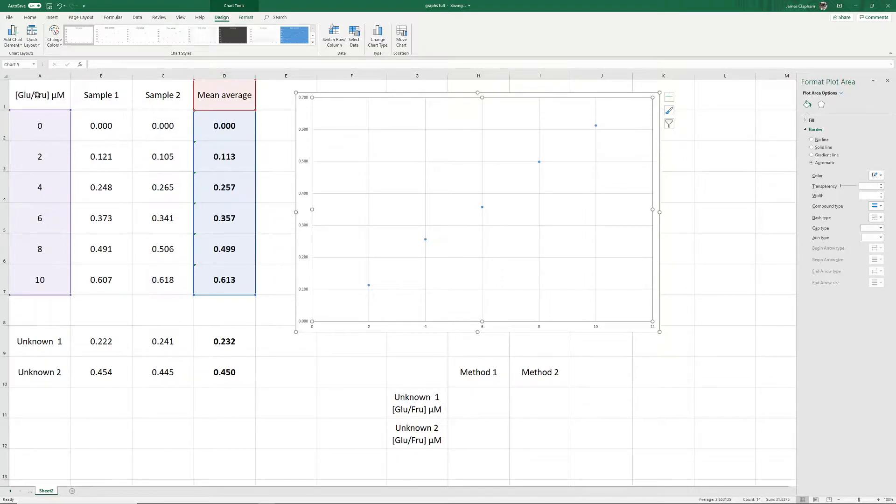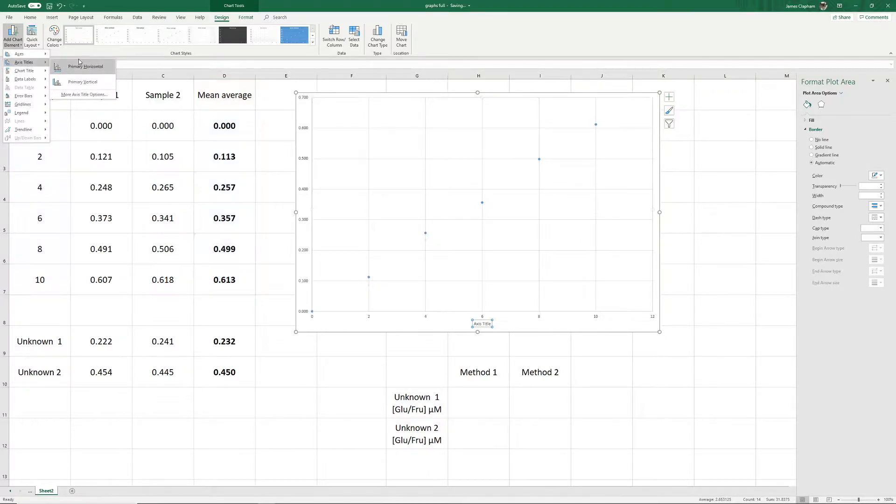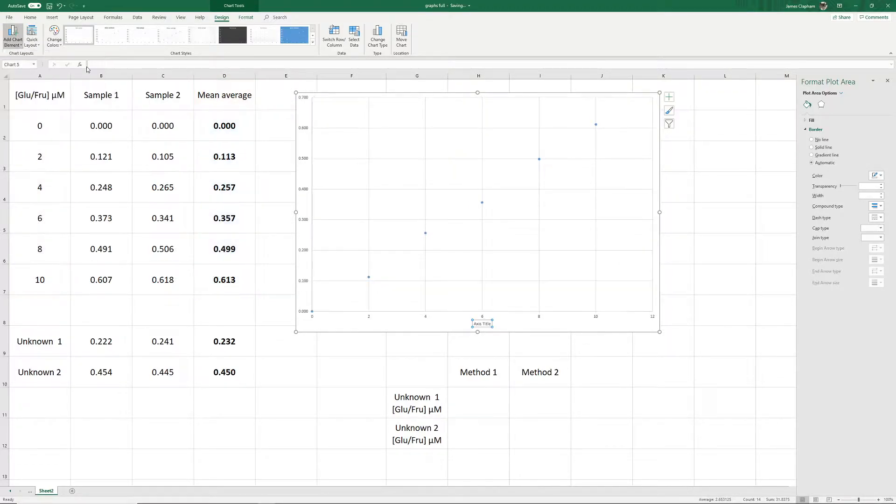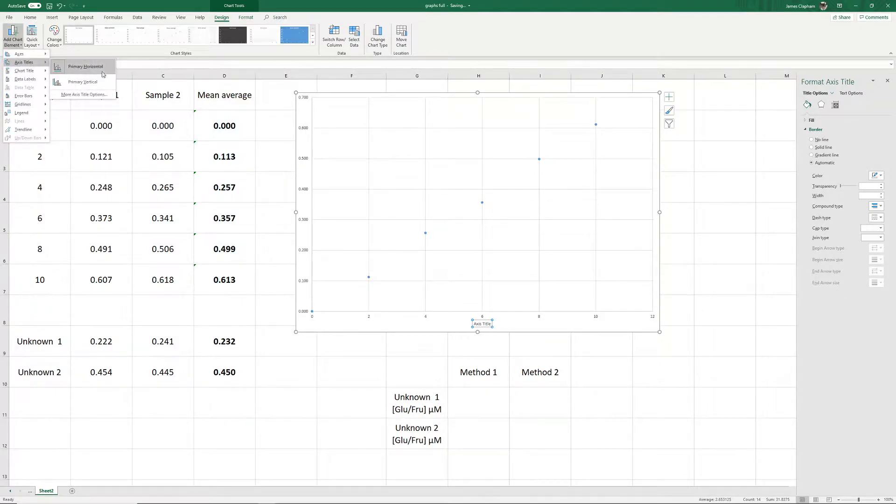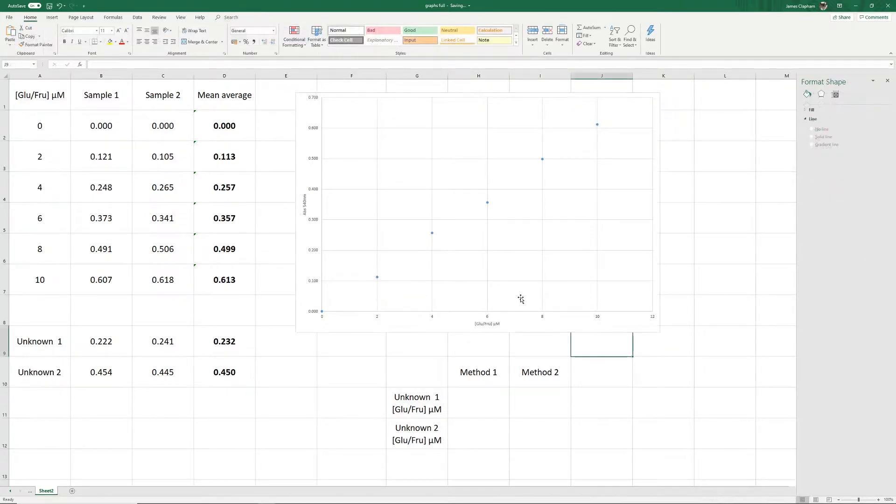These are very easy to add. You just go to Chart, Design, and then Add Chart Element, and Axes Titles. We've got Primary and Vertical. We want both of these, so select one and then the other. Then we can label up our axes.